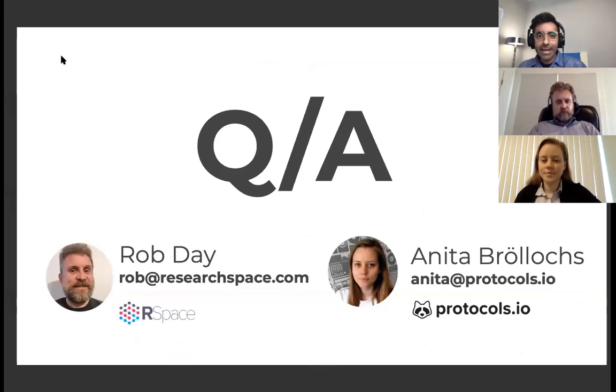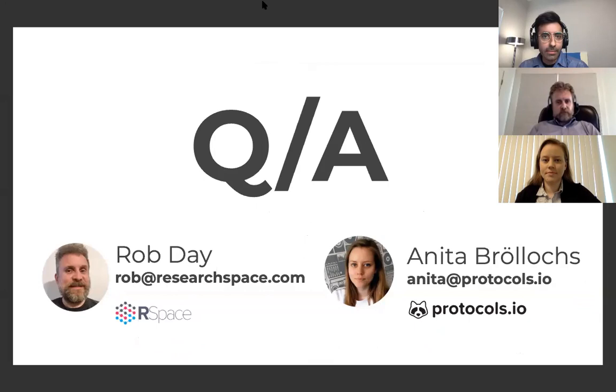Great. We have another question from Claire. Could you send a message on chat systems other than Slack, for example, Microsoft Teams? Yes, absolutely. RSpace supports integration with Slack as well as MS Teams, and also, in fact, Google Hangouts too.